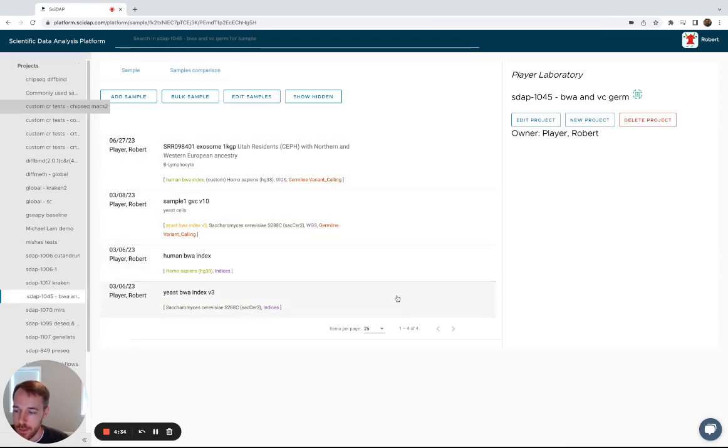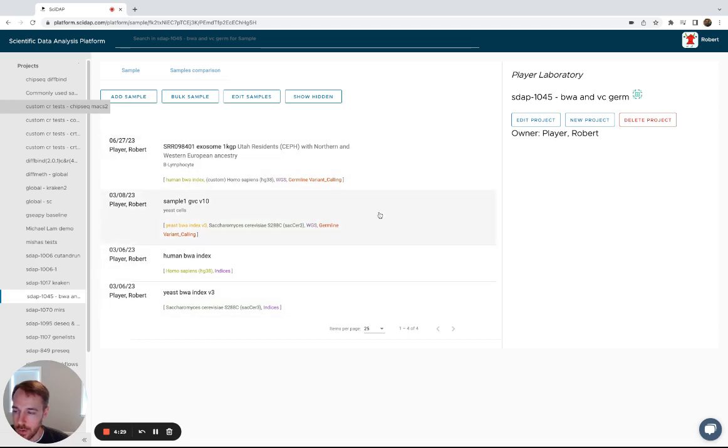Here you'll see two indexes that are already built and then two samples that have already been completed.